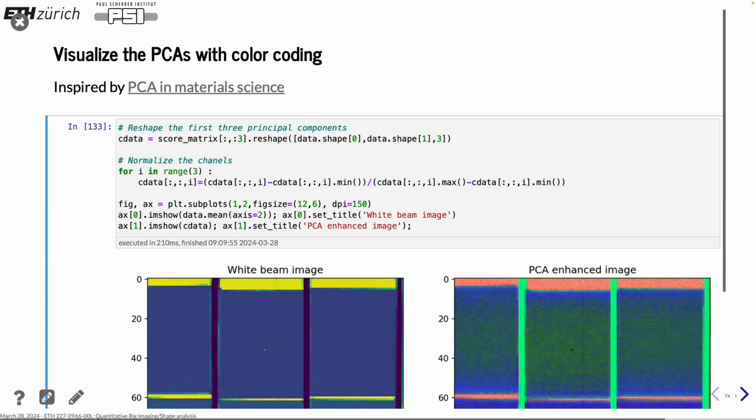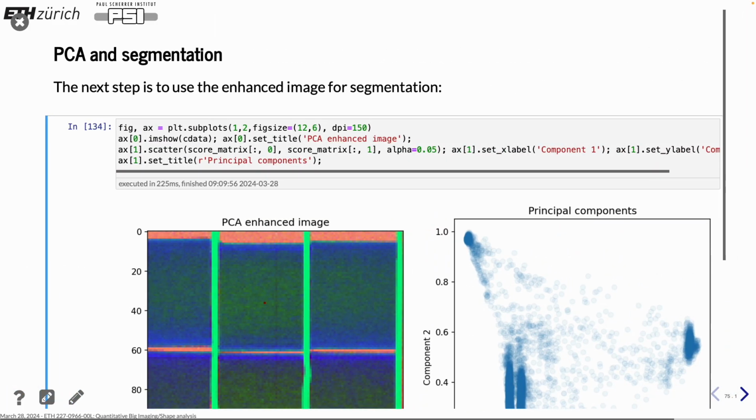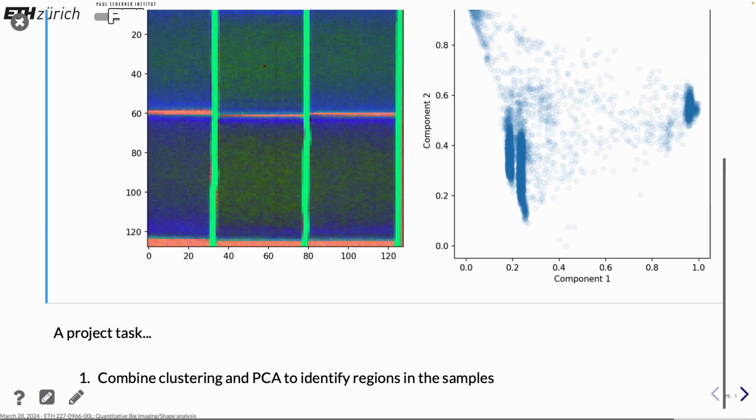And if I remember right, this data was laser treated to have a special surface as a surface treatment to make it harder. And well, here is another one. And then of course you can also use it for segmentation to try to identify different regions, which I haven't done here, but if someone would be interested, that could also be a little project task to play on with that.